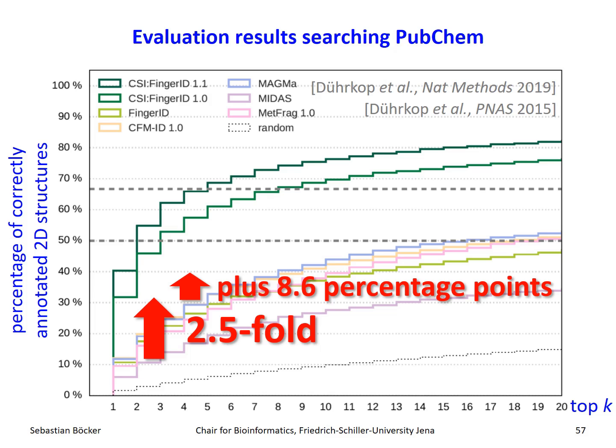I mean, we are searching here in PubChem, which is not what you would do in practice, but nevertheless, our hope was that at some stage we would pass 50 or 60%. I don't even know if that will happen. I mean, there are so many, let's face it, crappy spectra, and crappy spectra doesn't mean they are measured in a crappy way. It just means they contain practically no information. Yeah, 1 or 2 fragment peaks.